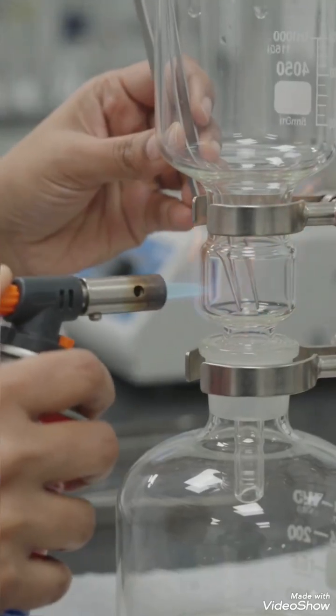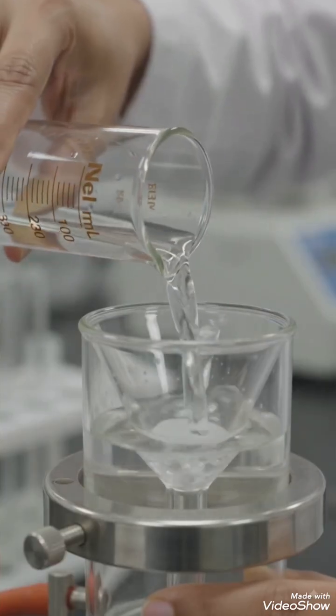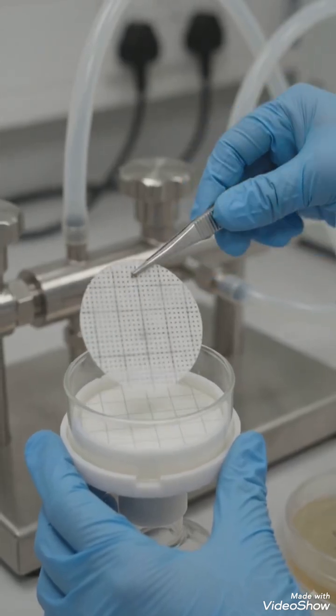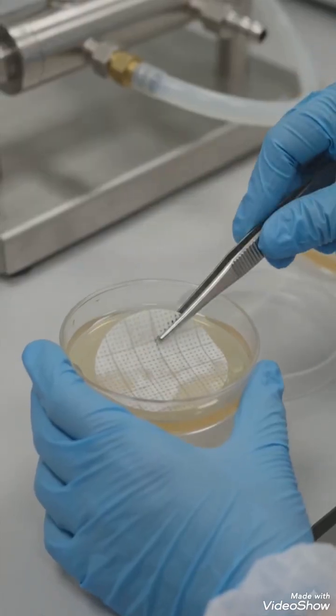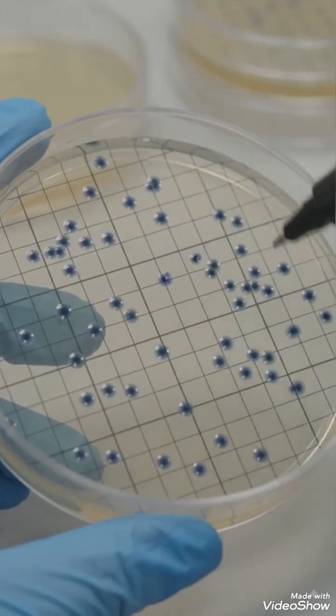Let's demonstrate membrane filtration. Sterilize filtration apparatus. Place sterile membrane filter. Filter measured sample volume, usually 100 milliliters. Wash funnel if required. Remove membrane using sterile forceps. Place membrane onto selective agar. Incubate. Count colonies. Let's calculate the CFU.